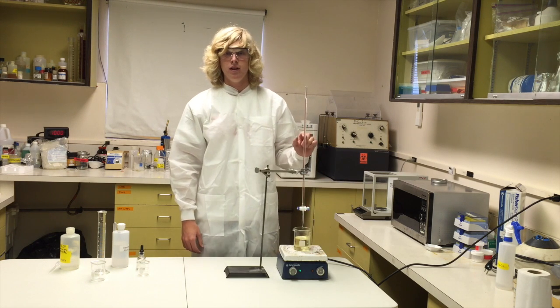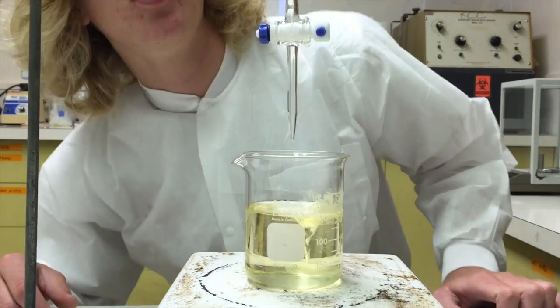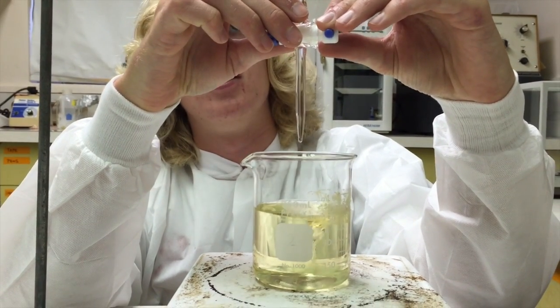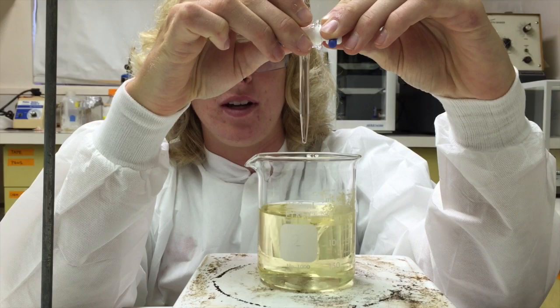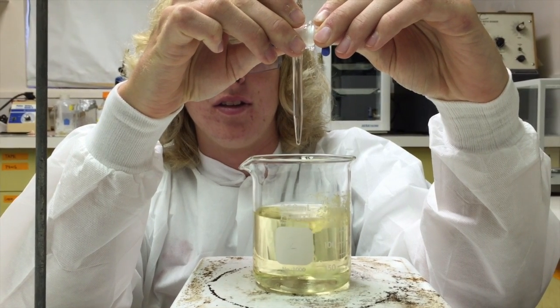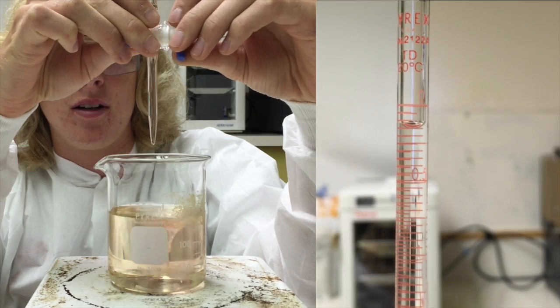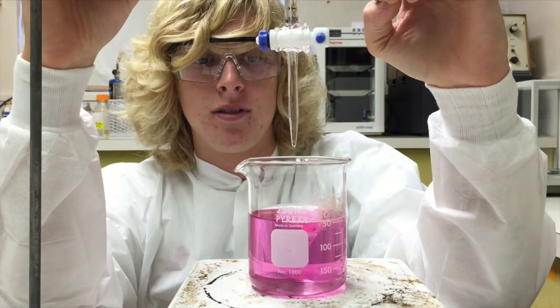Now we have our burette filled with 0.1 normal potassium hydroxide solution, just as before. Make sure to note how much your initial reading is on the burette. Once again, our case is 0. And we're going to add solution until it turns a bright pink and stays for 30 seconds.